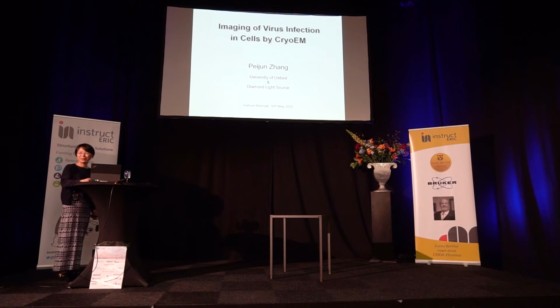So today I'm going to focus on some recent studies we have been doing for in situ structural determination to reach quite decent resolution. There are two stories I'm going to present today. One is SARS-CoV-2 infection, the spike protein in the virus itself as well as the spike protein structures on the vaccine candidate. And another story is the Rubisco molecules in the intact native alpha carboxysomes.